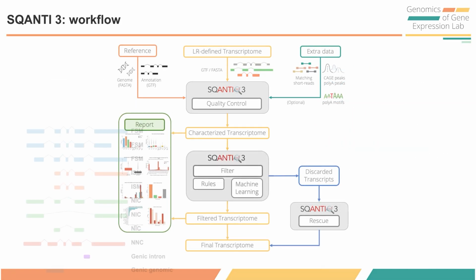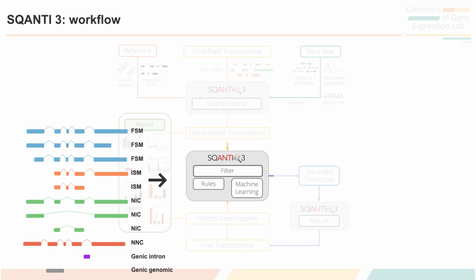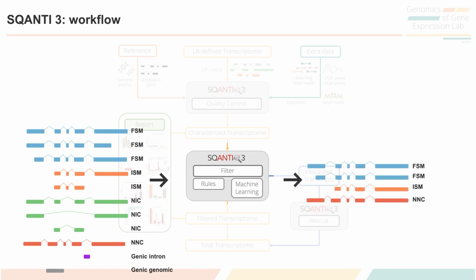The second is the SQANTI Filter for artifact removal. Using the large number of descriptors calculated by SQANTI3 QC, users can make informed decisions to remove potential false positive isoforms from their transcriptomes. This is particularly relevant considering the biases and pitfalls of current long-read sequencing protocols.